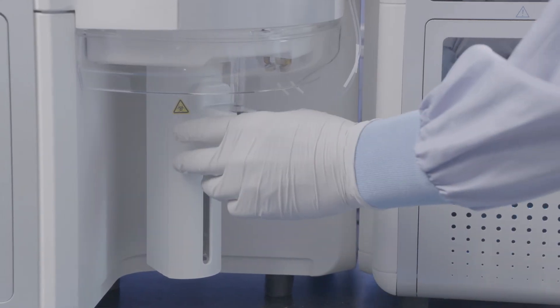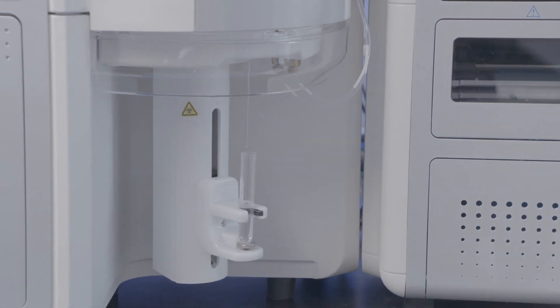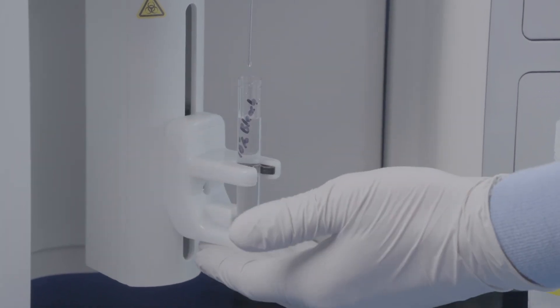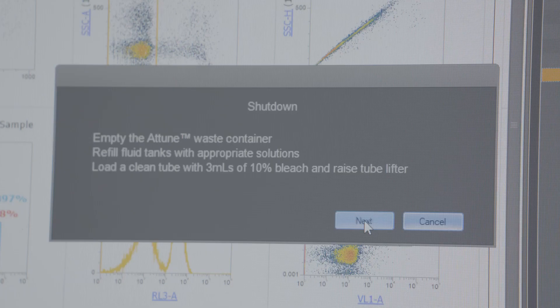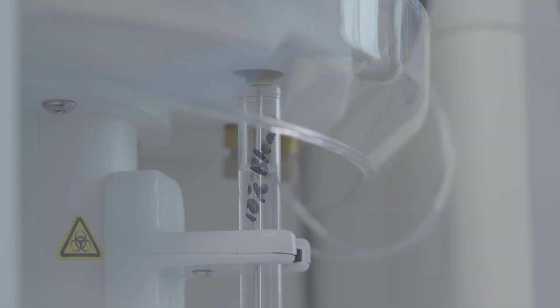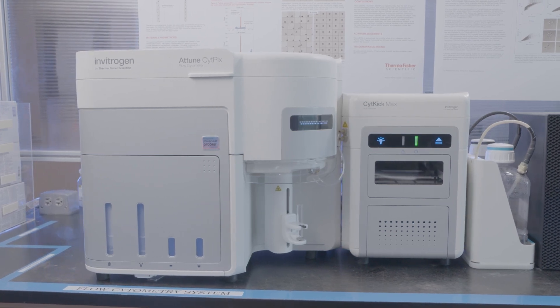When complete, to shut down your instrument, remove the sample tube from the sip. Load a cleaning tube containing 3 milliliters of 10% bleach. From the Instrument menu, select Shut Down. That's how you use the Attune SightPix flow cytometer.